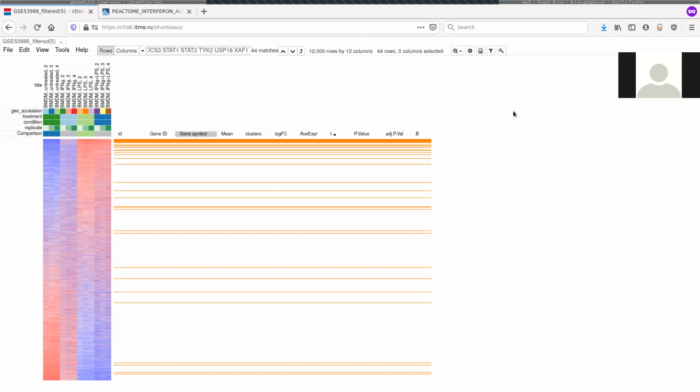I think I have. Good. And are there any problems? Have you been able to download the gene set, copy the genes, and so on? Okay. Well, hopefully it works for most of you.